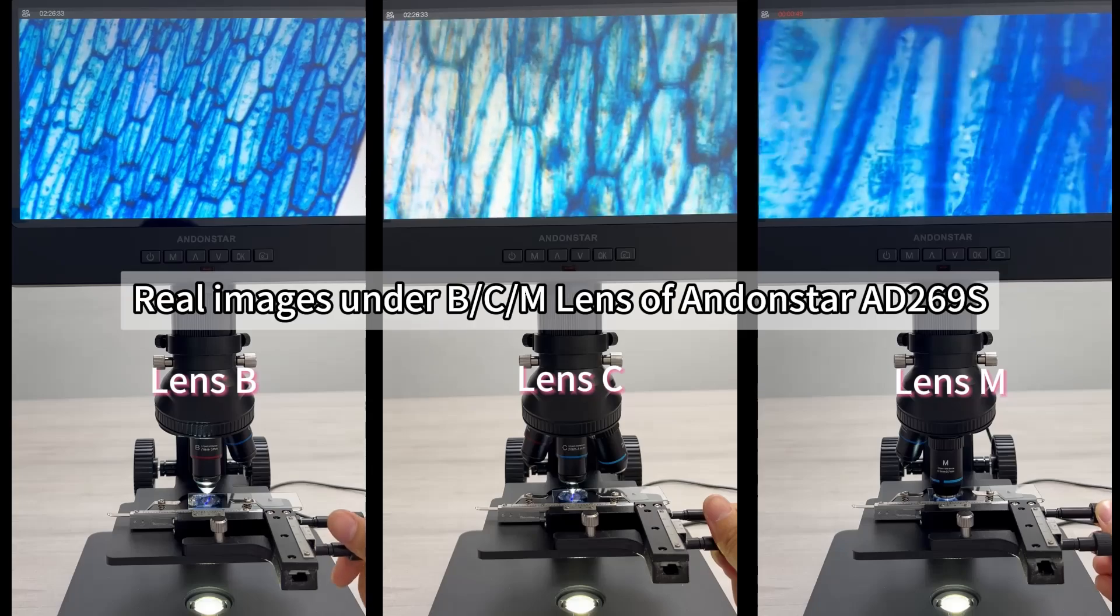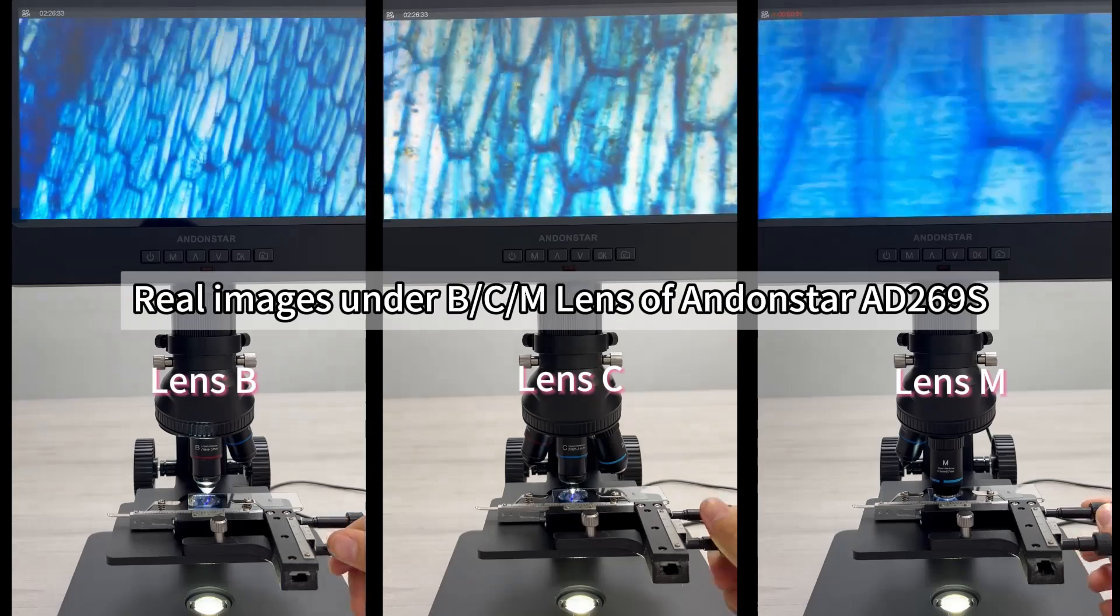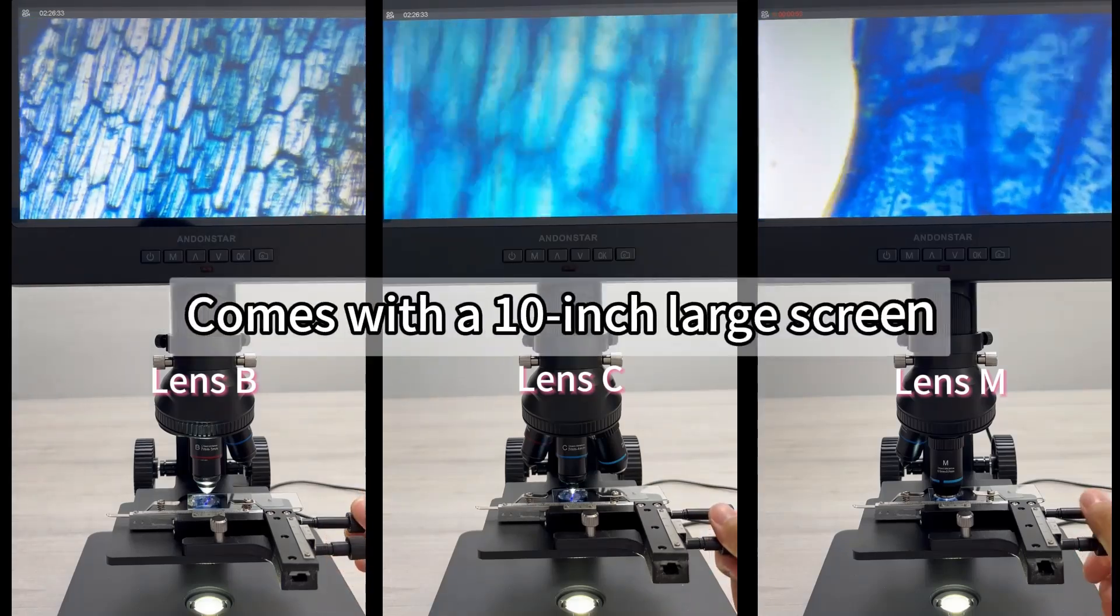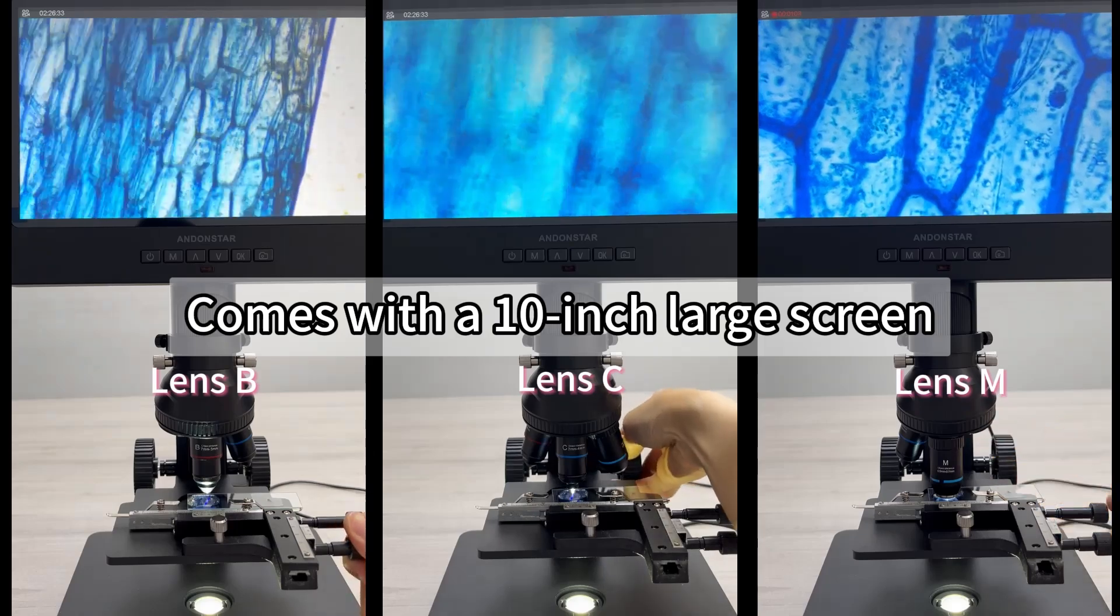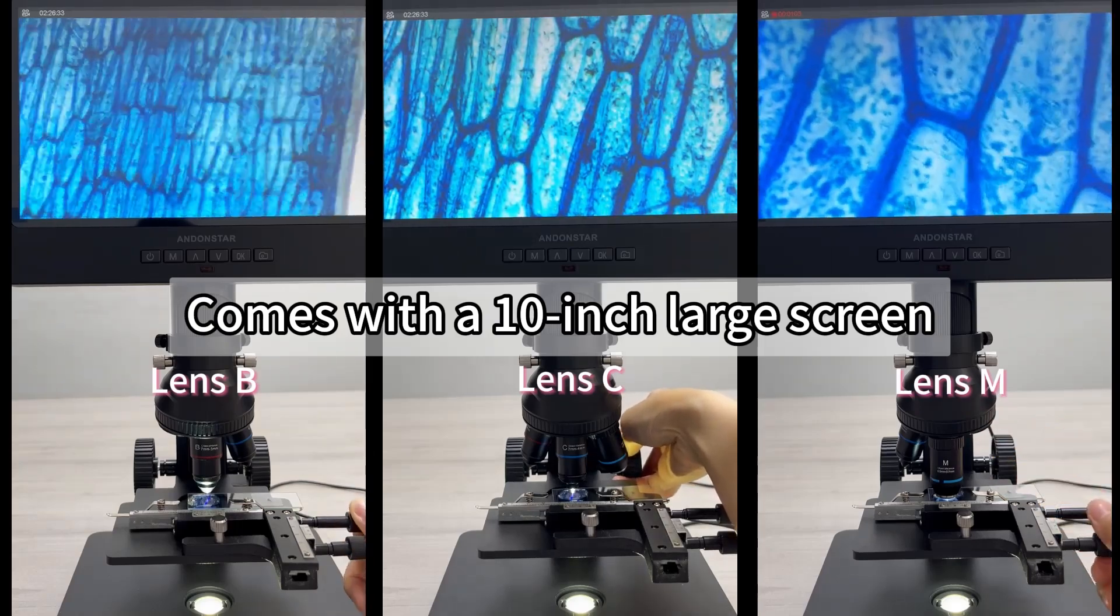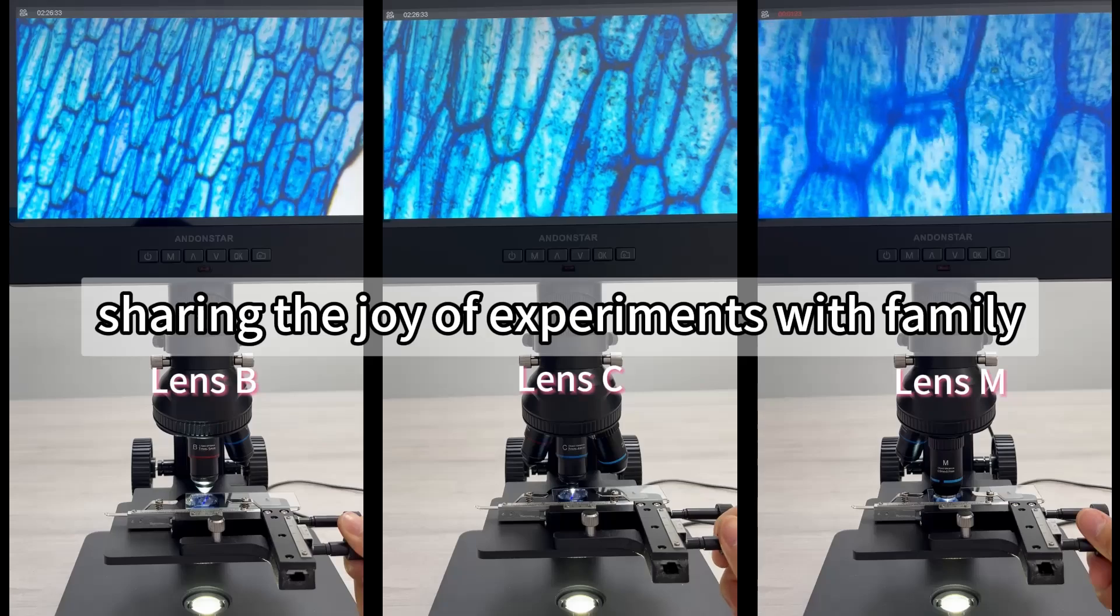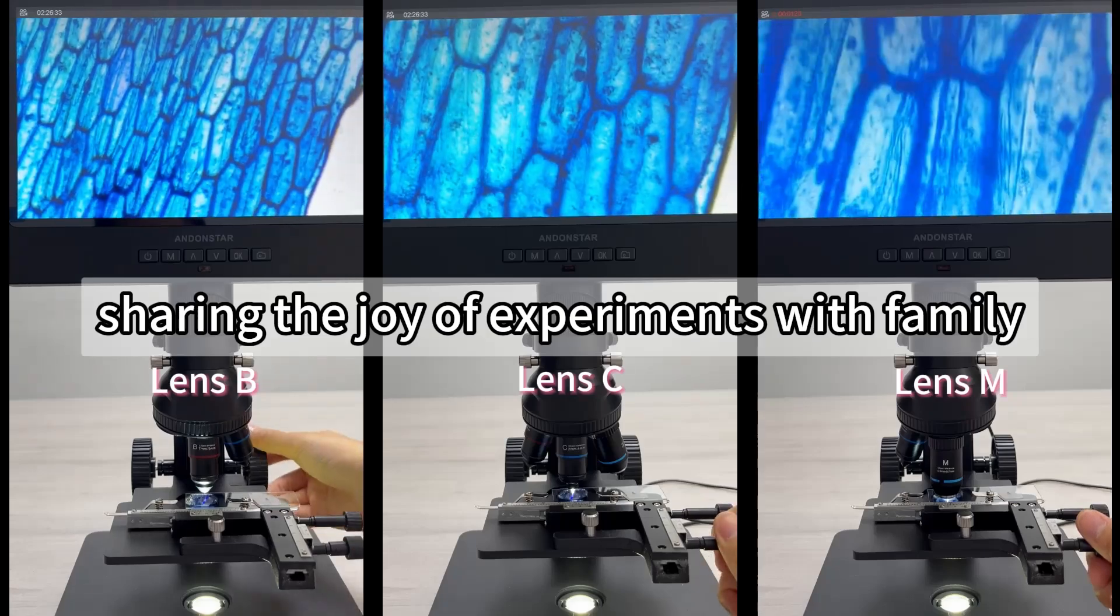Real images under B, C, or M lens of Andonstar AD269S. Comes with a 10 inch large screen. Sharing the joy of experiments with family.